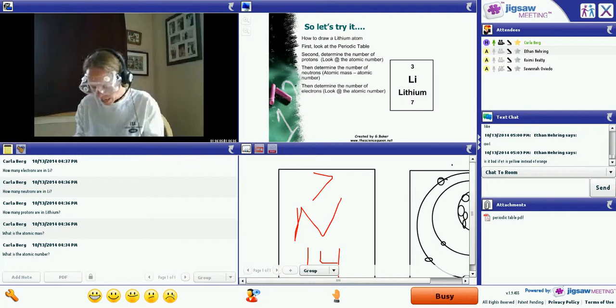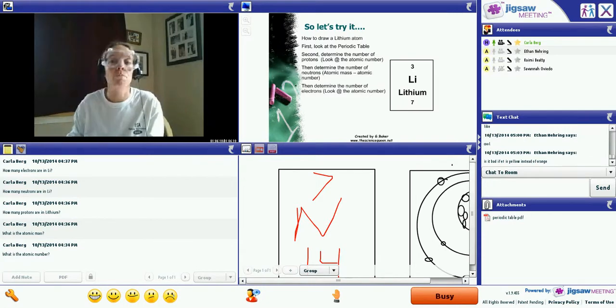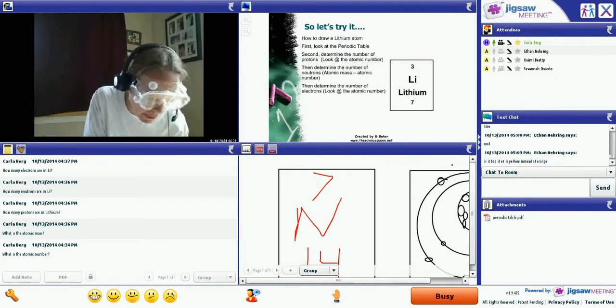Raise your hand if you have any questions on how we determined the ratio of copper nitrate to potassium iodide. Okay, if you look at your wells, I don't want you to do anything with them right now. You certainly can look at them. But it has not quite been 5 to 10 minutes yet.